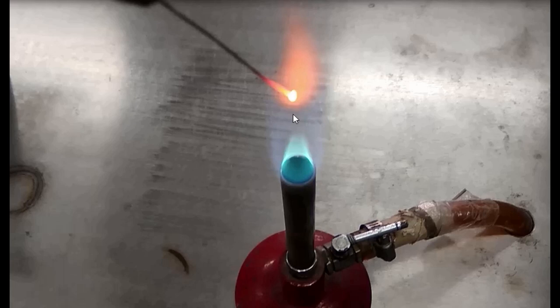Having this type of high temperature and requiring less space, it is also called a micro incineration plant. That is why it is also included in sterilization as a physical method.